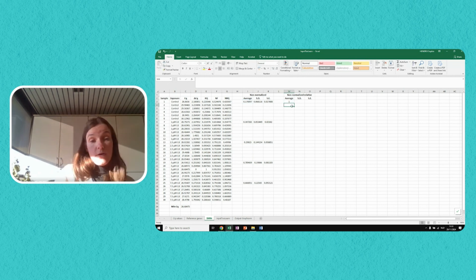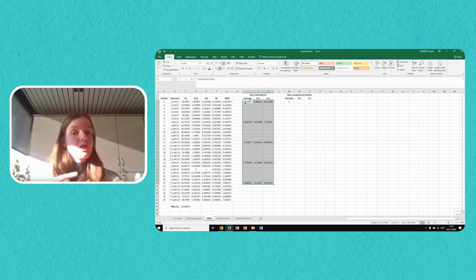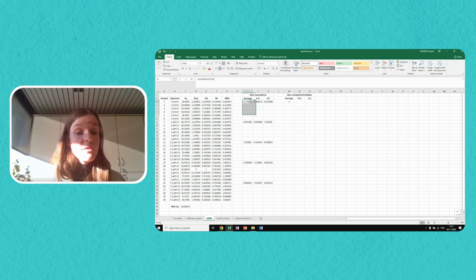And now, of course, we also need to divide all the other values that you can find here by this same value, because of course we don't want to change the proportions or the ratios between the different values. We just want to express them in a way that's easier to interpret. So each of these values we will divide by 0.17.